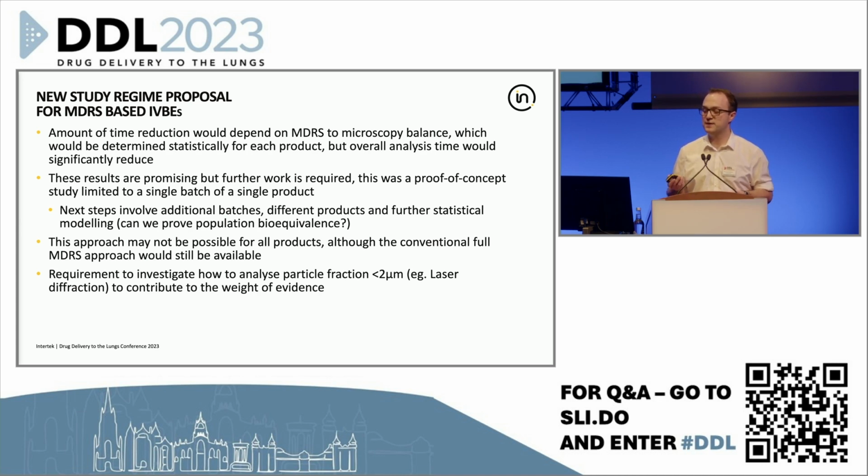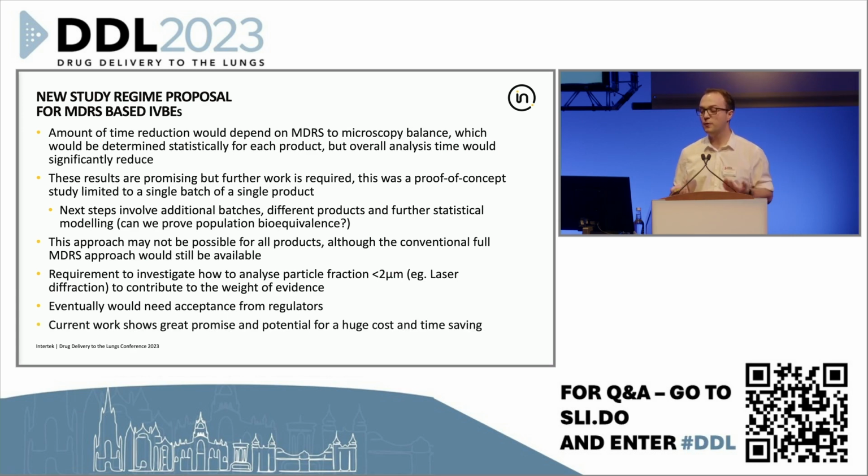As an example, laser diffraction has been mentioned by the regulatory guidance, and eventually we would need the regulators to give a hypothetical acceptance of this regime, because clearly no manufacturer is going to pay for a study like this without knowing that they will say yes to it should their results be sufficient. But overall, we believe this work shows great promise and has a huge potential for cost and time savings.